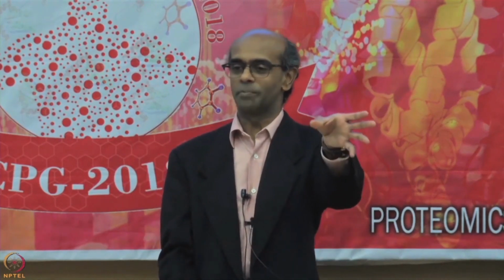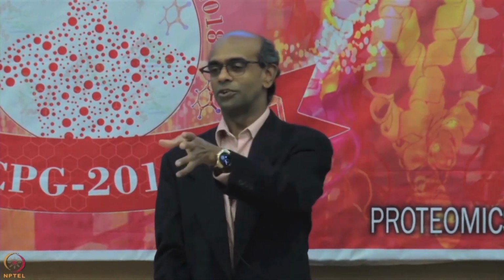So you decided to run all your ER positive samples in the beginning of your study. You are doing everything in 1 week, but you decided to run all your ER samples on the first 3 days, and then you are doing your PR samples on the next 3 days. And on day 2.5, your column got clogged and you had to throw it away. So now all your ER samples were run with the old column and most of your PR samples were run with the second column. There is a difference.